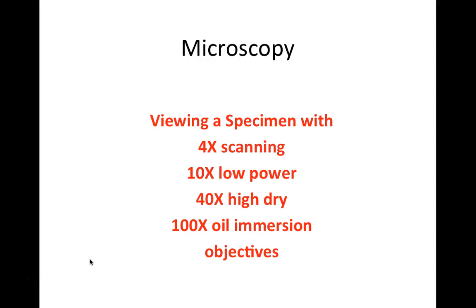When viewing a specimen with your microscope, we have the possibility of using four different objective lenses. An objective lens is a magnifying lens; we denote the power using the letter X. We have a 4x scanning objective lens, a low power 10x objective lens, a 40x high dry, and a 100x oil immersion objective.